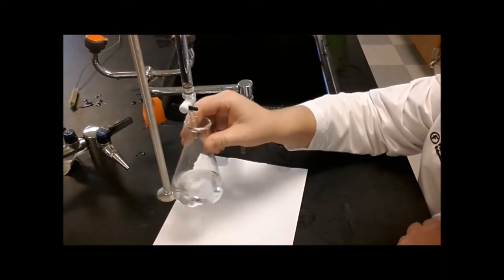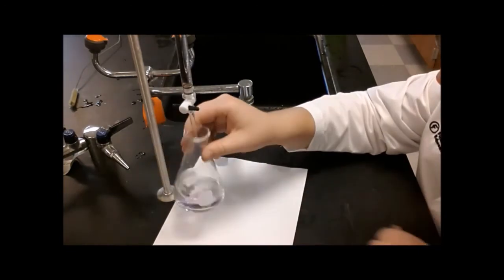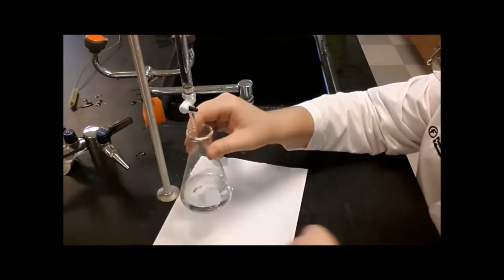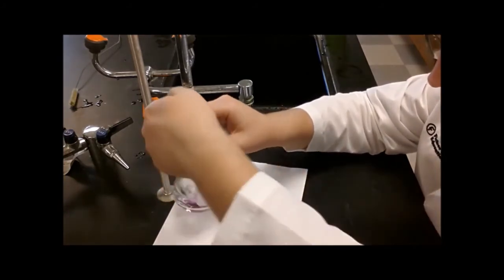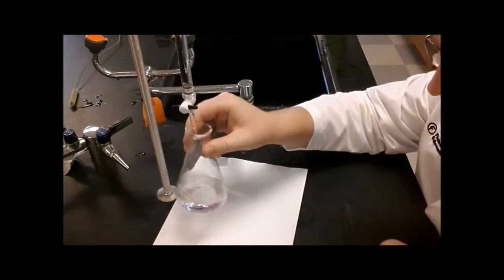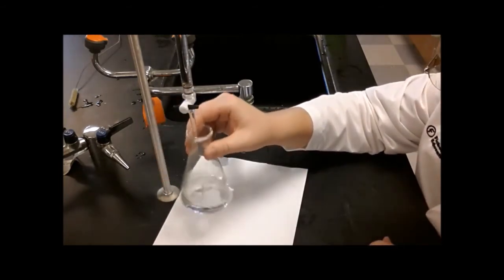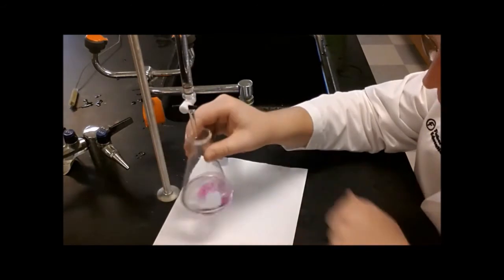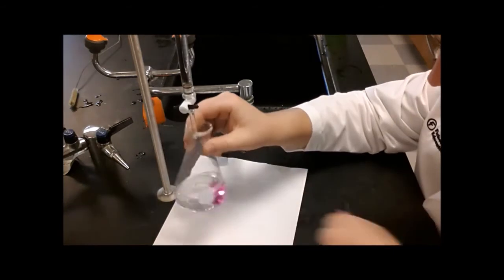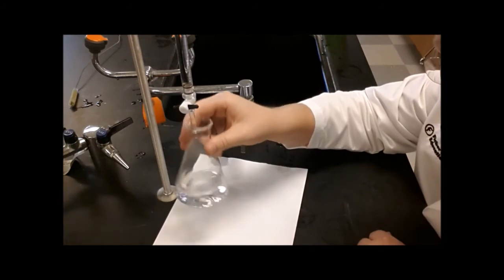Notice the purple color. That pinkish purple color shows you when the titration's over. Notice that I'm not just letting it drain in there anymore. I'm just quickly turning the stopcock and that lets out a quick squirt of base. And I have to continually swirl it so that I don't overshoot the endpoint. Swirly, swirly, swirly. Now, that squirt took a while to go away. Fast squirt. This squirt is taking a while to go away. I might want to switch to drops at this point.